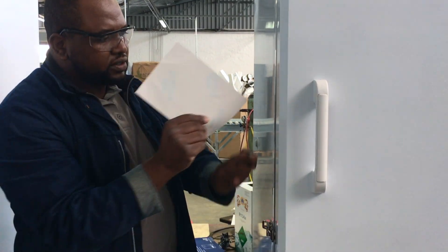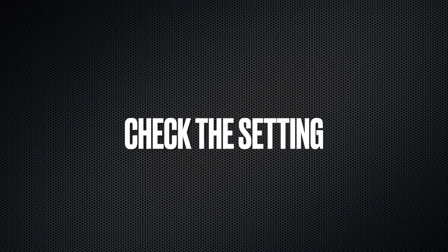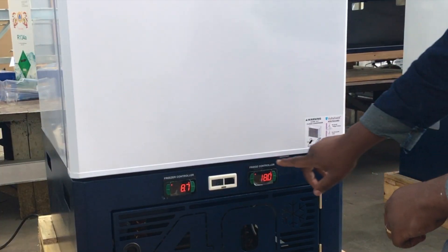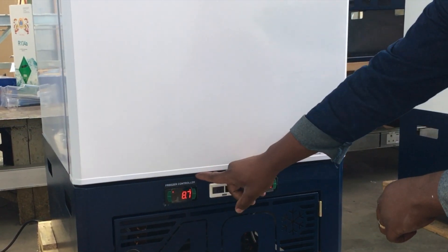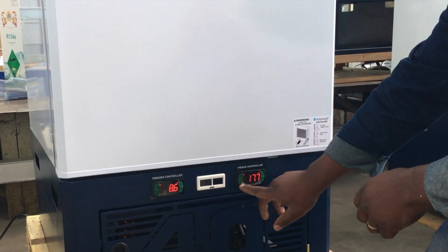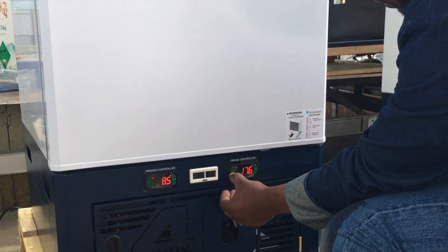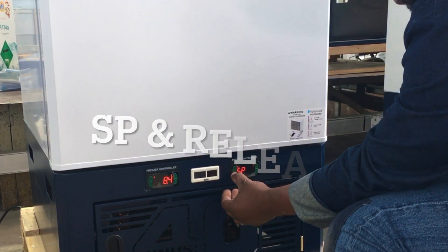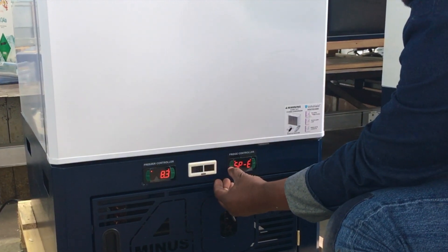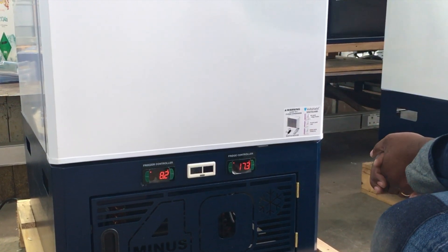Check all around the fridge. Then check the settings. We have the fridge controller — the TC900 full-gauge controller — and the freezer has a full-gauge 514E controller. The set point for the fridge on the B-series is 4 degrees. Press and hold the set button on the bottom left until you see 'SP' appearing, then release. It should show 4, meaning the set point is correct. Press the set button again and it returns to the fridge display temperature. At the moment the temperature reads 17.2 — a B-series takes at least 5 to 6 hours to reach set point and will then work within a range of 2 to 8 degrees.